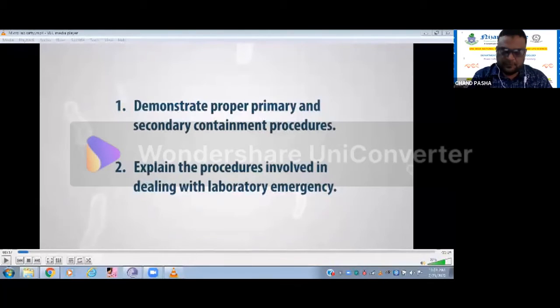Good morning, all. As requested yesterday, a few of you asked me to explain the safety measures in the laboratory. I would like to discuss those few things, then I will discuss the general problems we handle in immunology.